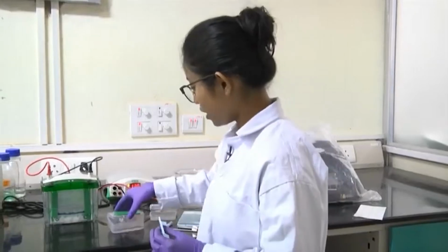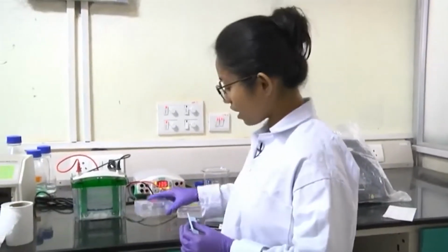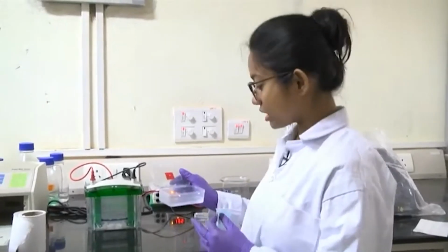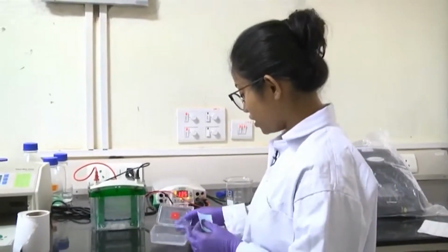Before we go for this blotting, we need to equilibrate the membrane as well as the gel in the transfer buffer for some time. While my gel is running, I will put this membrane in transfer buffer, since it is already activated and I don't need to put it in the methanol. I have a small amount of transfer buffer in this small box. It has Tris, glycine and methanol.